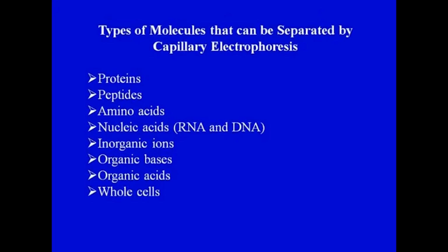But increasing the capillary length will not by itself improve the separation. Many different kinds of molecules can be separated by capillary electrophoresis, ranging from proteins, peptides, amino acids, nucleic acids, inorganic or organic molecules, organic acids, and a lot of others.